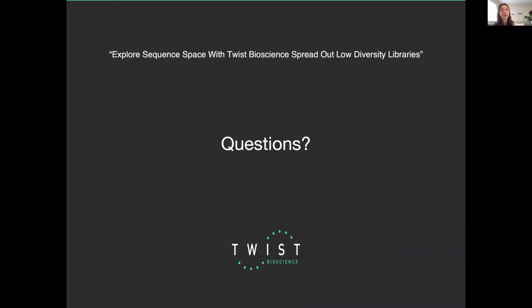And then, since it's 5 KB, I'm not sure if SOLD is the best library for it, but we can probably do something either with SVLs or CVLs, but definitely need to take a look at the sequence and the design itself. I mean, we can find ways to piece them all together, but until I have an idea of what the design looks like, I can't make a confident statement about what approach we can take.